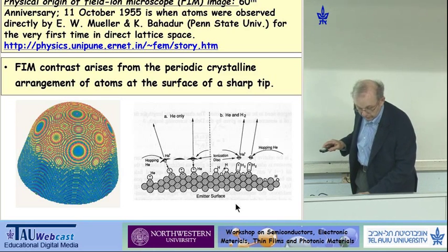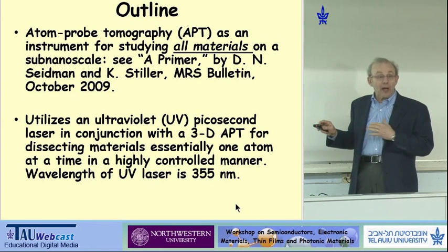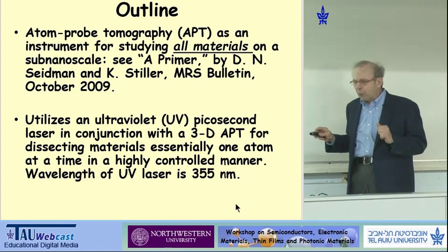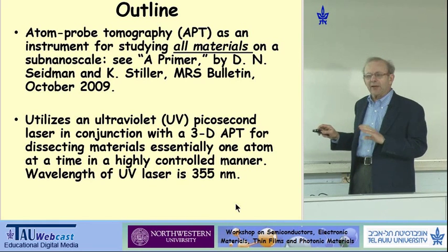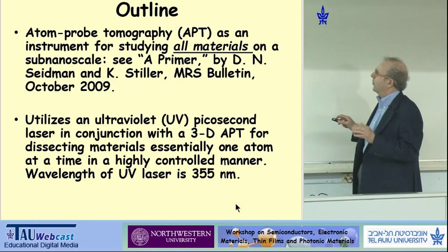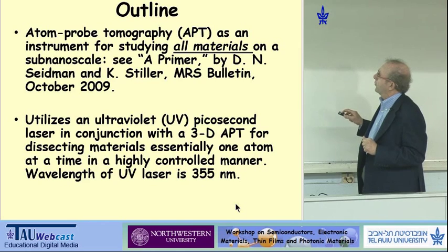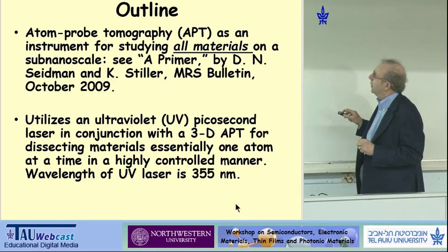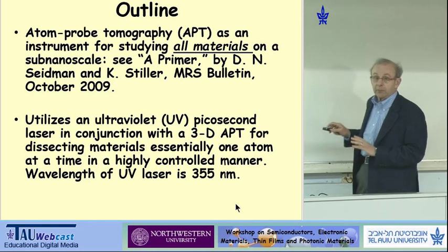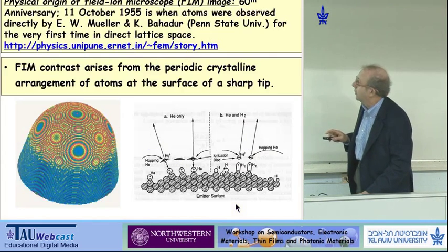Okay, nowadays, and I'll explain this to you in a moment, with the arrival of atom probe tomographs, the problem is people have stopped taking field ion images, but there's a lot of information in them, and part of the problem is technical, just the way these instruments are built. With Christina Stiller, who's in Gothenburg in Sweden, I wrote a short primer with her explaining the technique, and it's in a special issue of the MRS Bulletin.